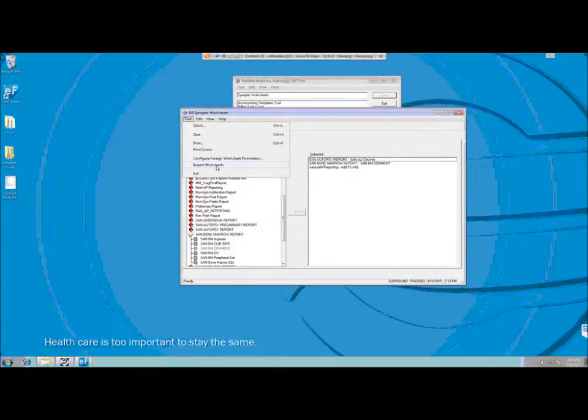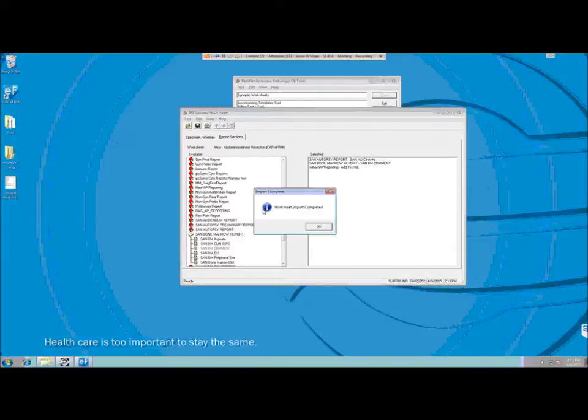So launching the tool would scan the mTuitive database and pull in the worksheets, but you can also import worksheets manually if you already have the tool up and running. And we have added the new import worksheets menu here, and clicking on that would pull in the worksheets from the mTuitive database. So this is pretty much what's involved on the build side.